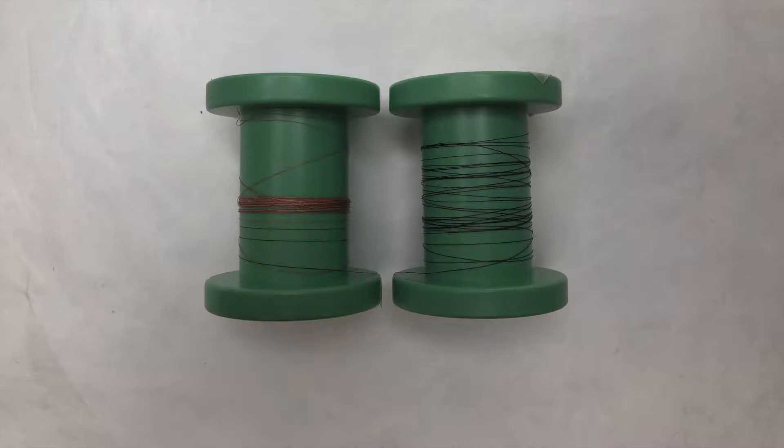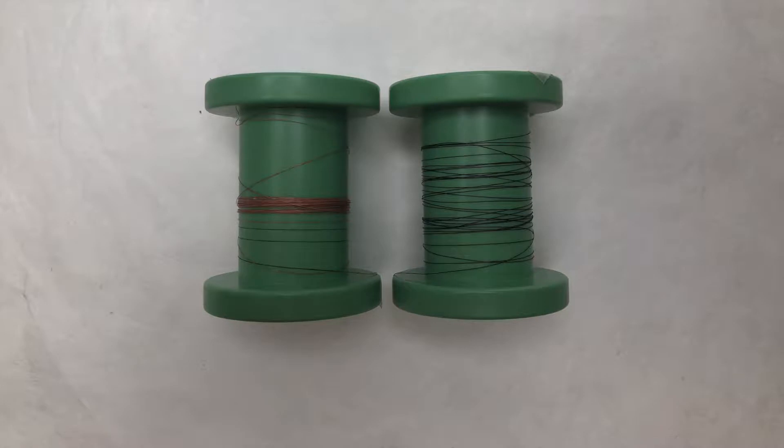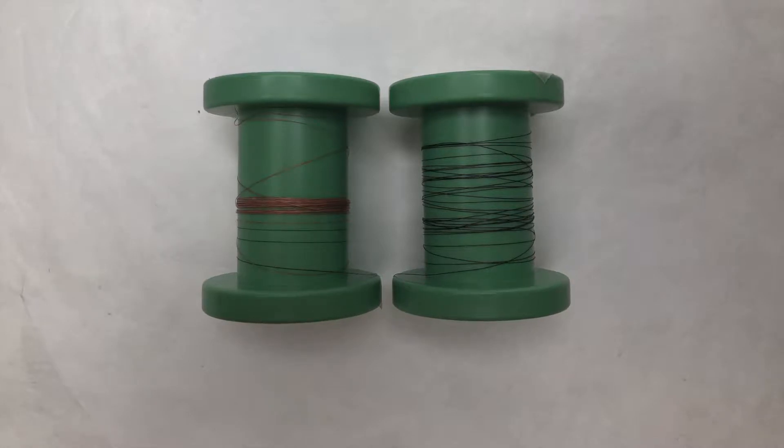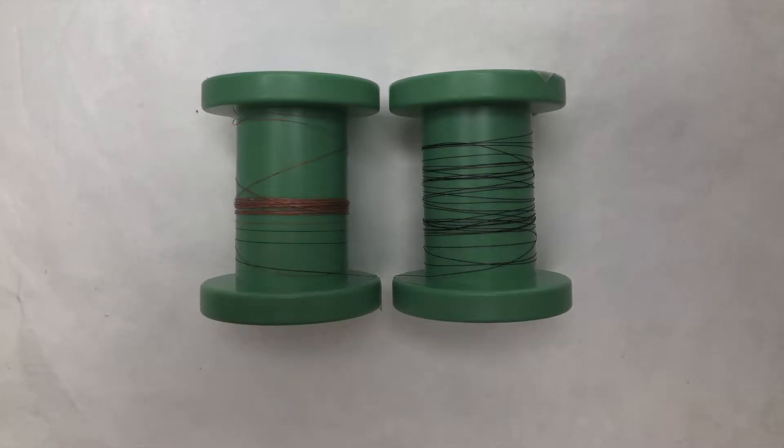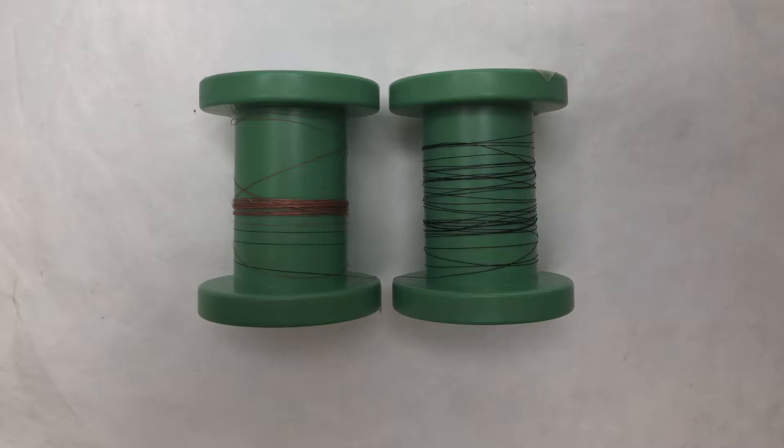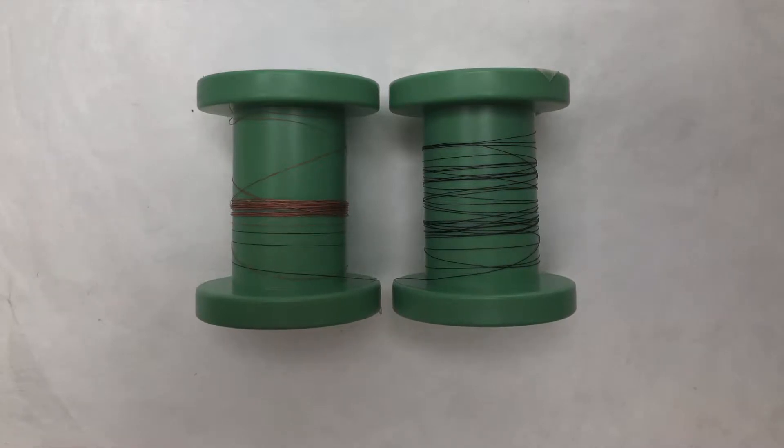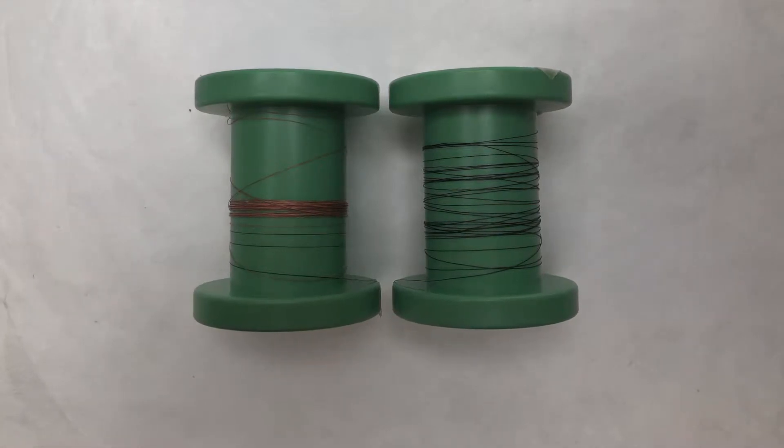Hello, this is Colin from Dexmat. Today I'd like to give you a look at one of the new things that we're working on here at Dexmat, and that is the ability to coat our carbon nanotube yarns or other carbon nanotube materials in layers of metallic copper.